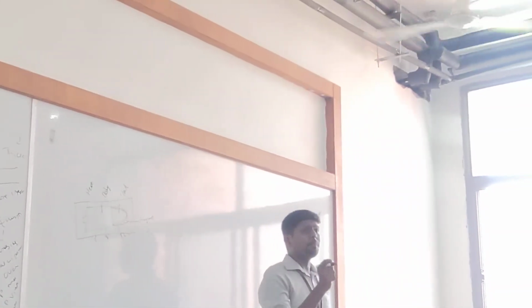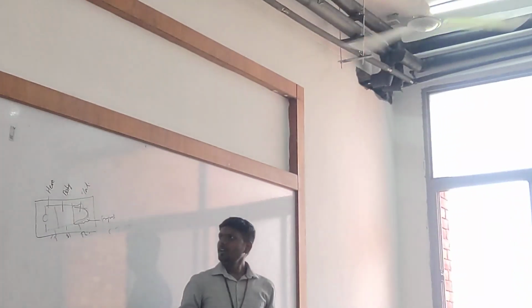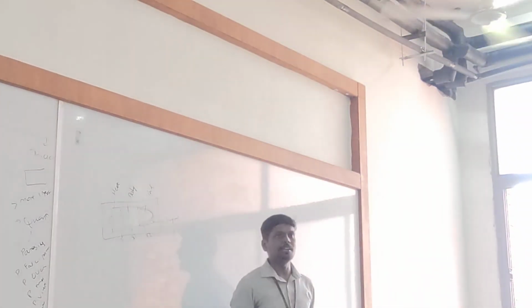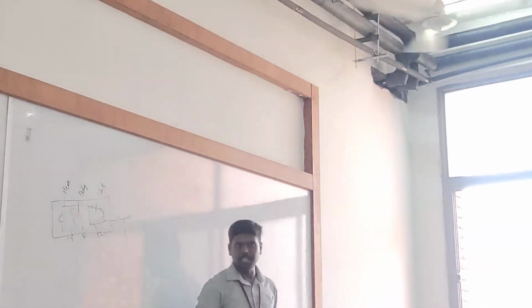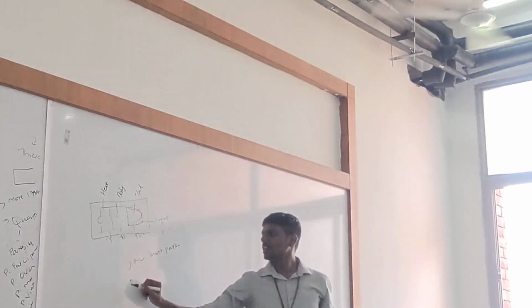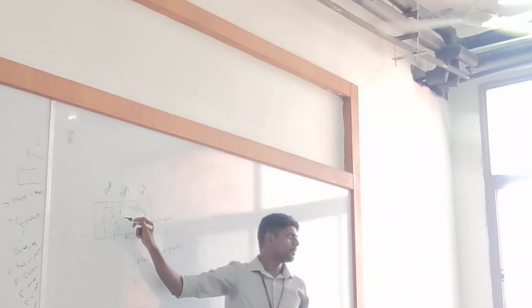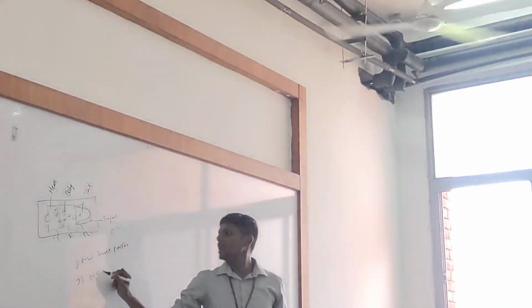Now, what possible mistakes will you make leading to an error report? Let us assume the room has so much dust or the slide has many dust particles. You will interpret dust particles as stained particles and count them as cells. That is why the slide should not have any dust particles. Rule number 1: no dust particles. Rule number 2: when you are making a smear, if you wrap it wrongly, there will be air spaces, air bubbles. These air bubbles look like cells. So no air bubbles must be present.